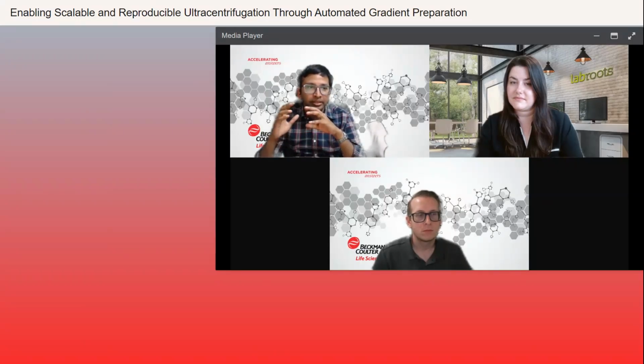Ultimately, you have to realize that these are peristaltic pumps, that there is going to be some wear over time, and that life cycle or that lifetime can be reduced with increased rounds of sterilization.